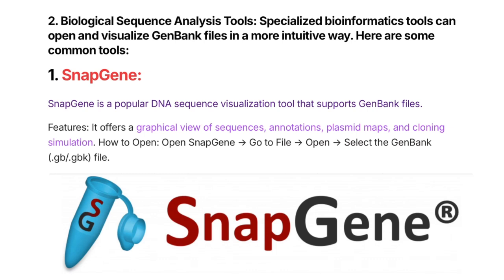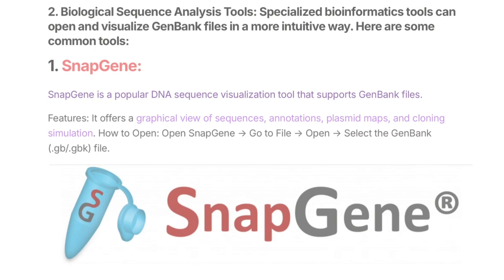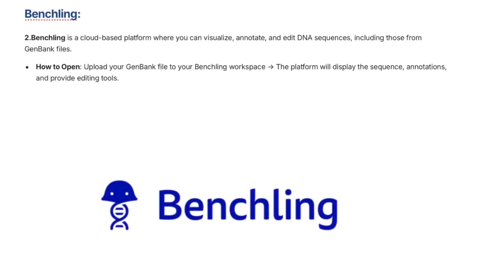Biological sequence analysis tools are specialized bioinformatic tools that can open and visualize GenBank files in a more intuitive way. SnapGene is a popular DNA sequence visualization tool that supports GenBank files. It features a graphical view of sequences, annotations, plasmid maps, and cloning simulations. Once you open SnapGene, you can go to File > Open and then select the GenBank file, which has a .gb or .gbk extension.